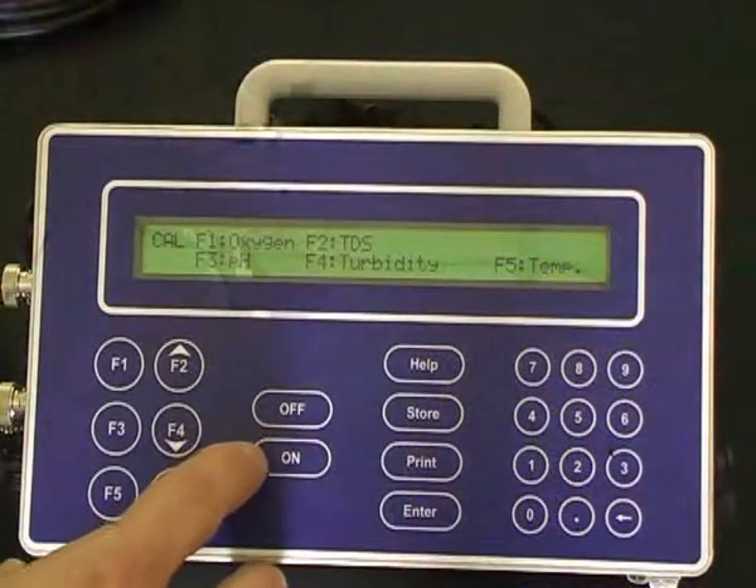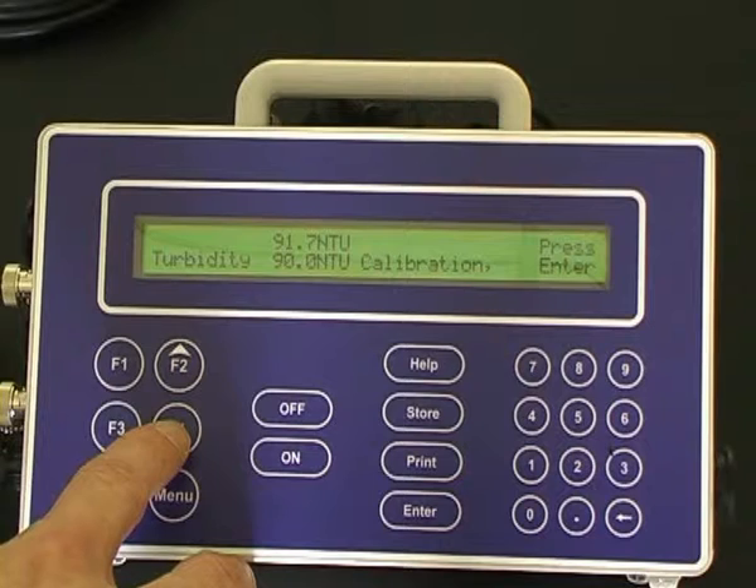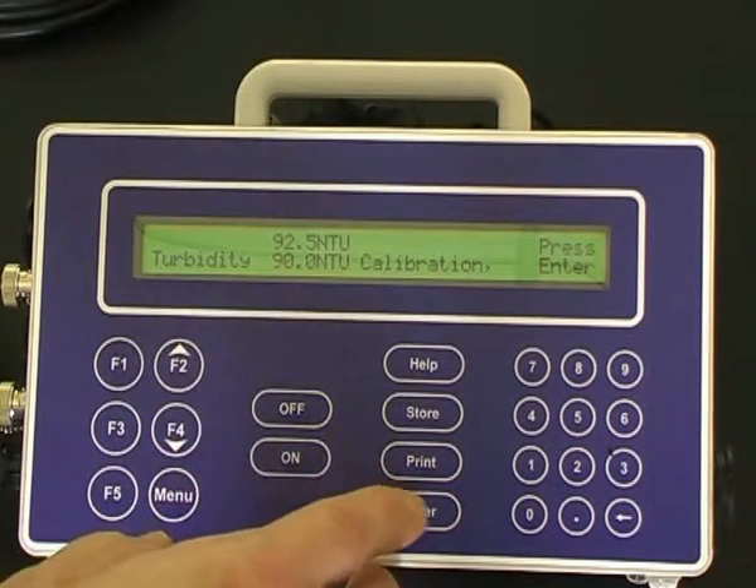Once the sensor has equilibrated, press F4 for turbidity. Allow the sensor to equilibrate to the value, and then press enter.